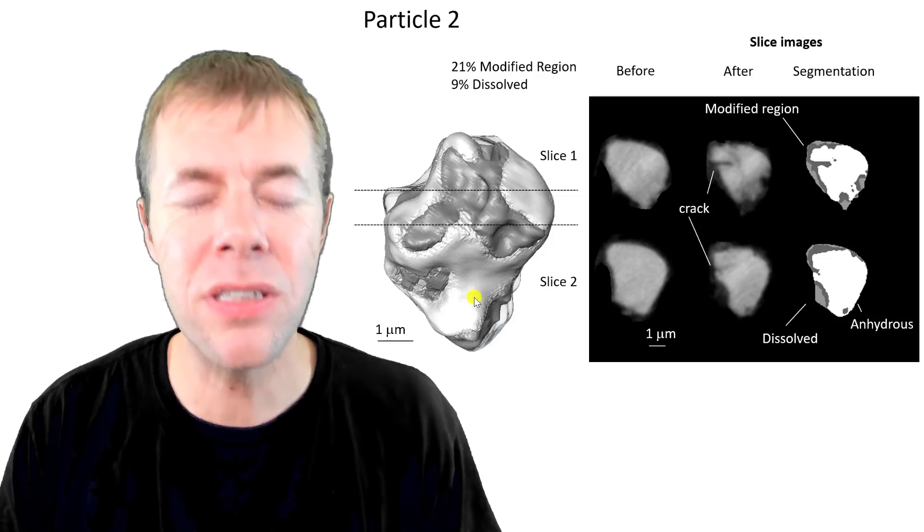Here's another particle. This particle, again, we're showing two different cross sections. Isn't it strange that right here it's not reacting at all, but right next to it, it's reacting a bunch. And this particle is actually showing cracks that are digging inside of it. And there's actually crevices inside the particle.